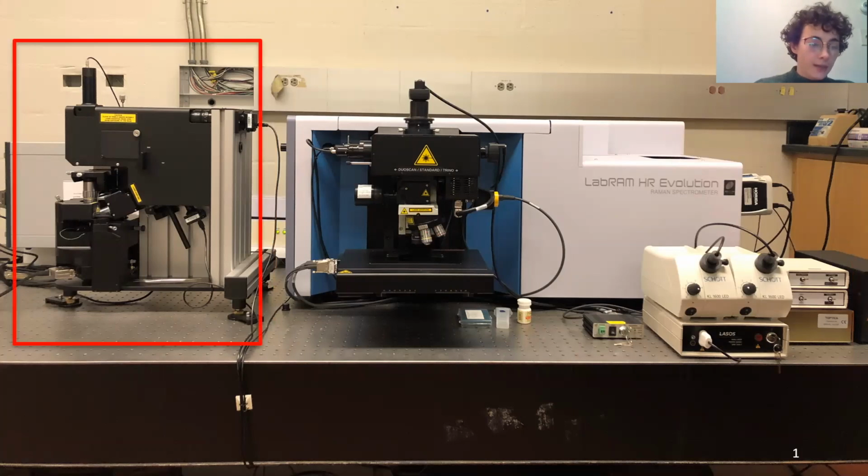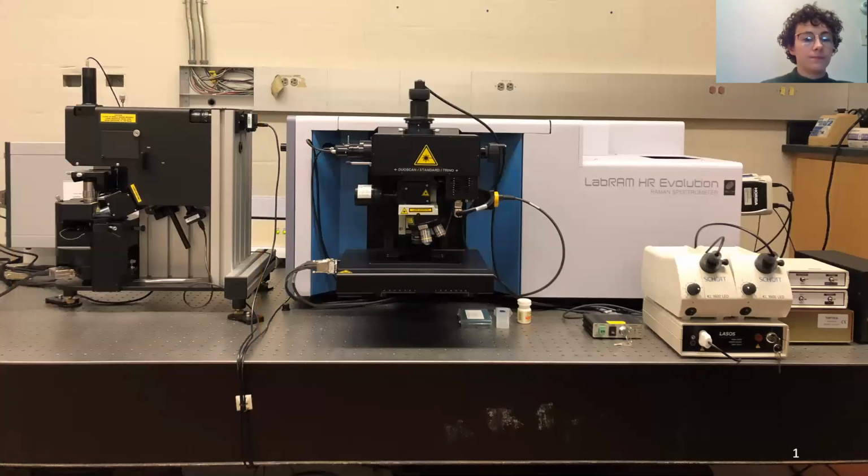The AFM side of the instrument can be configured for temperature-controlled liquid measurements, air, or conductive AFM experiments. But the most exciting use of the instrument comes when you combine the 2 together for tip-enhanced Raman spectroscopy. When combined, you can collect Raman images with a spatial resolution of around 10 nanometers.